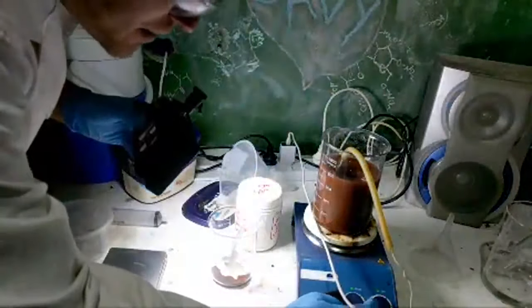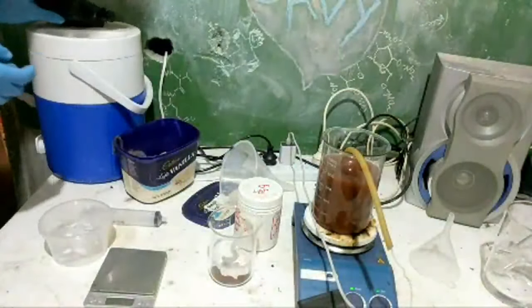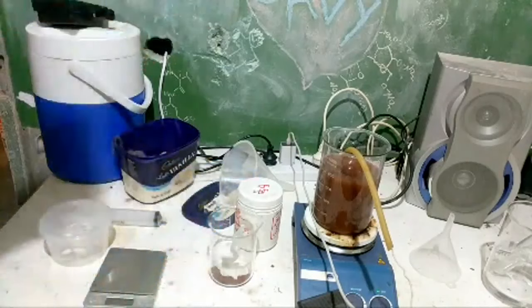Let's get this heating a bit, just a little bit, because at the moment it's still cold. Still only 10 degrees, which I count as cold. Let's have a go at just filtering a little bit, see if we'll get any colour at all.